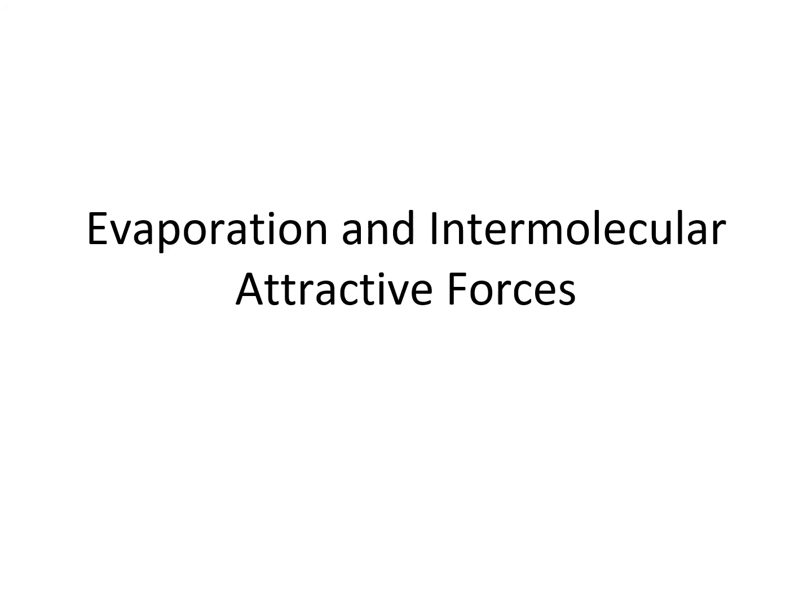Hey guys, in this experiment we are looking at evaporation and intermolecular attractive forces. So evaporation is a physical property. That means it is something that we can observe, but it is controlled by chemical processes that we do not see. And that's why we want to understand what these chemical processes are that produce the effect of evaporation that we can observe. And have you ever wondered why we use rubbing alcohol and not water for cooling? Well, at the end of this session, you should be able to understand why that happens.